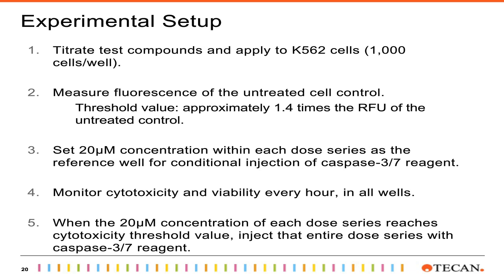Now, the cytotoxicity threshold works as an if-then condition. So if a well reaches the cytotoxicity threshold, or this certain RFU value, then the reagent gets injected into that entire dose series of compound. The software requires a reference well for this threshold, so we used our highest concentration well within each series, which was 20 micromolar in this case, as that reference. Just as before, all wells are monitored in real time for cytotoxicity and viability. Once that reference well within each compound series reaches that cytotoxicity threshold, the reagent gets injected to that entire series. The plate is incubated, and then luminescence is recorded.